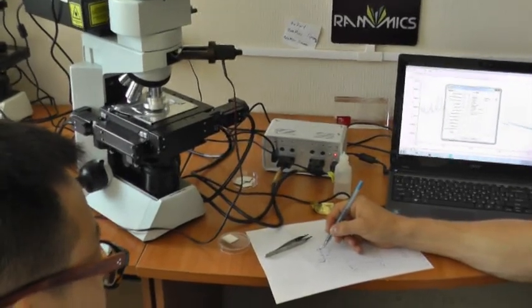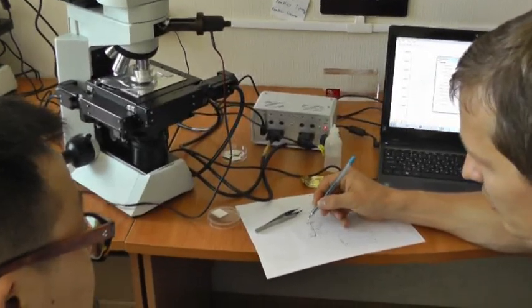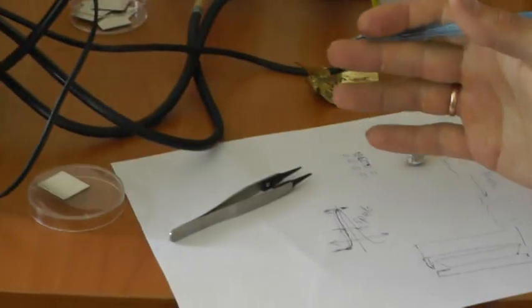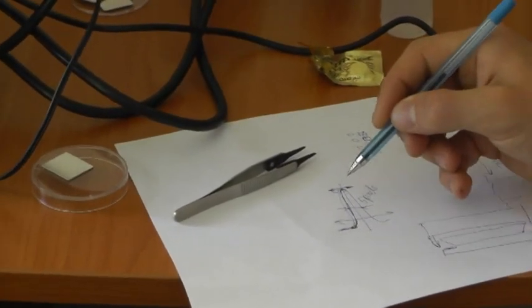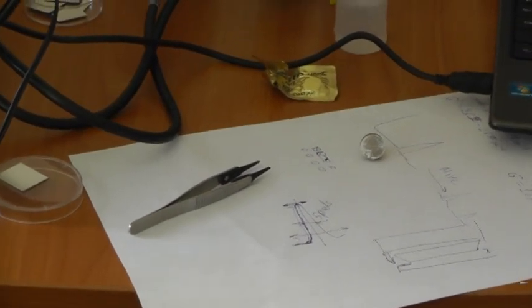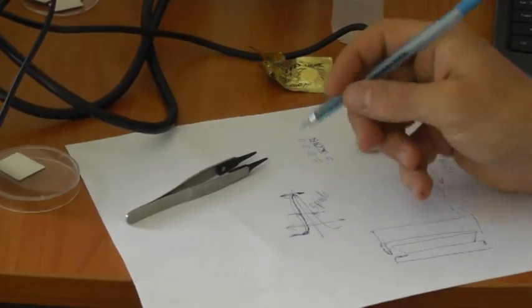That's why we know that the actual laser position can be shifted by approximately the line width. That's why auto shift is measured in percent of the line width of the laser.